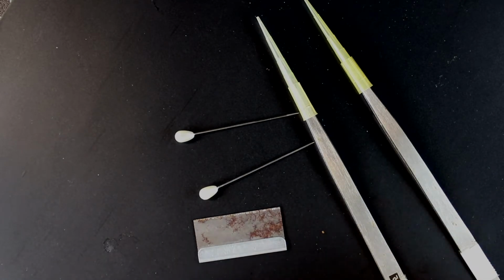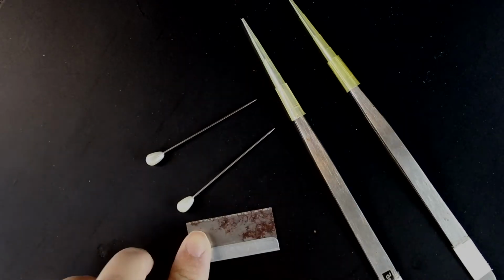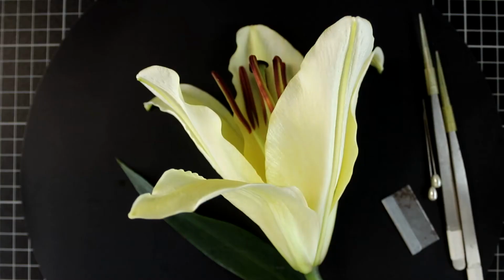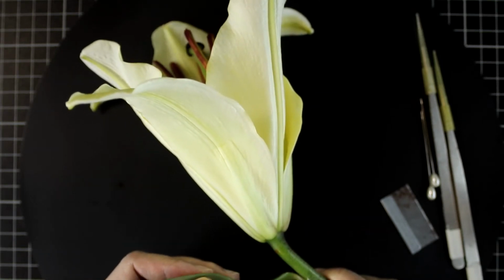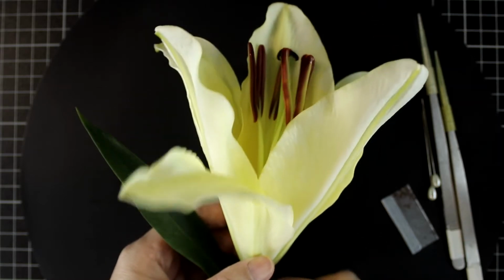Here I show you some tools that you need for the flower dissection: some pins, razor blade, and some fine forceps. Here I show you the lily flower. When you cut the flower out, remember to include the first leaf so that you won't miss any floral part.